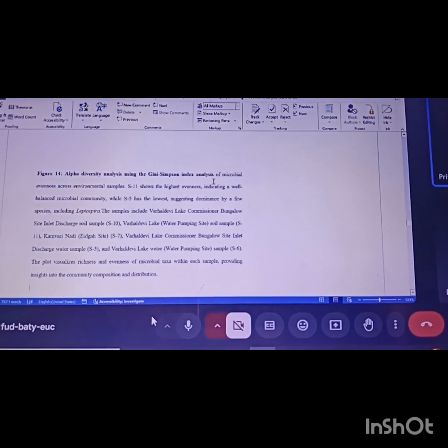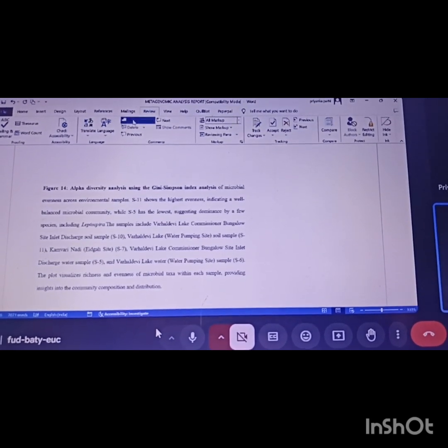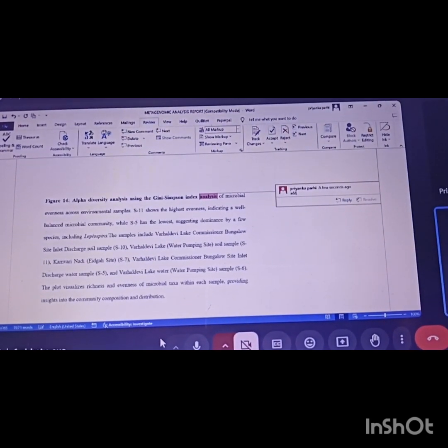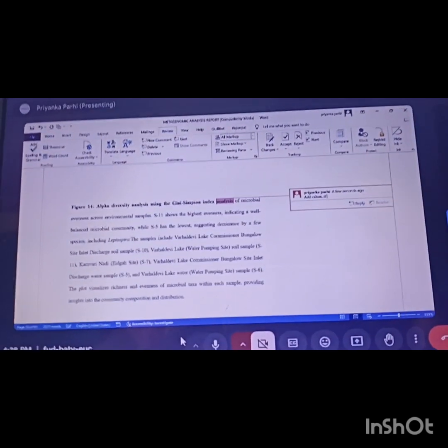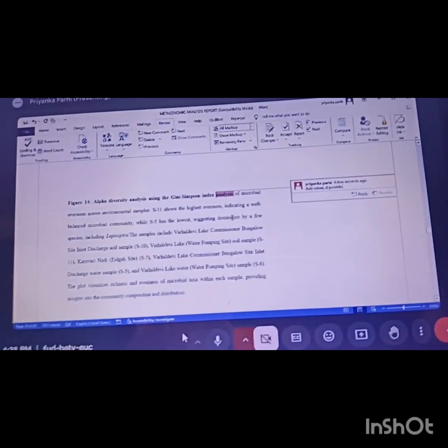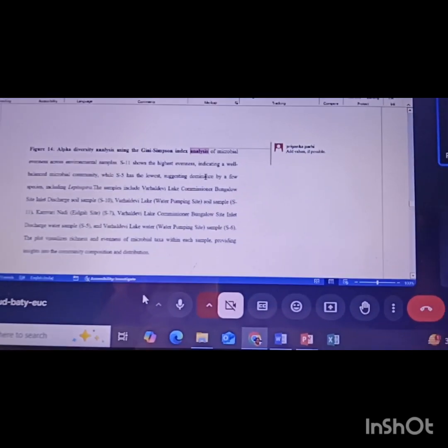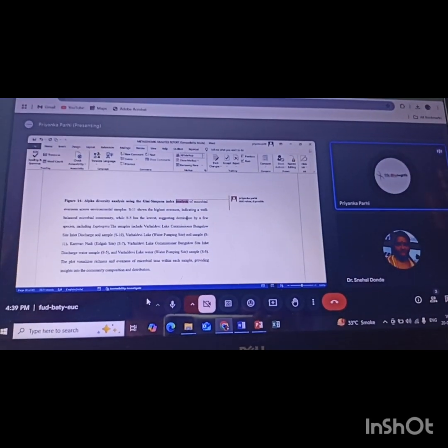Let me check. I don't think that's possible, but let me check. But at least with the plot which is already there, if you can explain that. Ma'am, all the plots are cumulative data. It means the data is huge, it's cumulated, and then the plotting is done, all inside the software. We are not using Microsoft Excel to see what values are given.